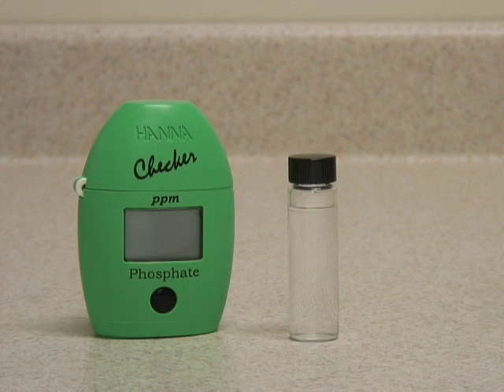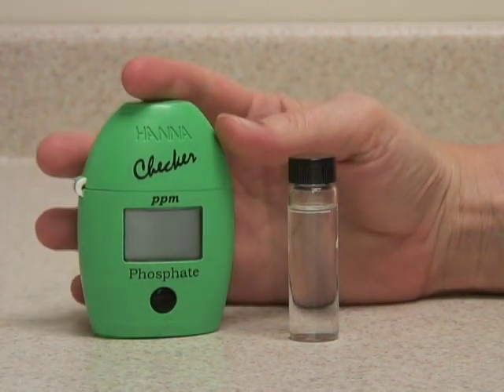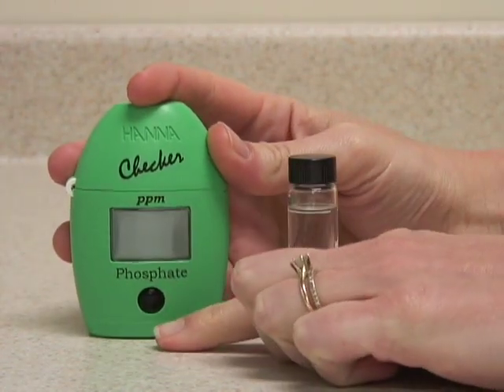This is the Hanna Instruments Checker HC Meter for Phosphate. This meter is very easy to use — it operates with a single push button.